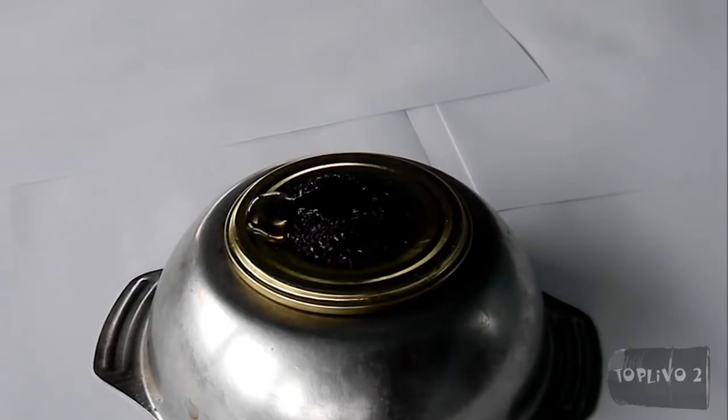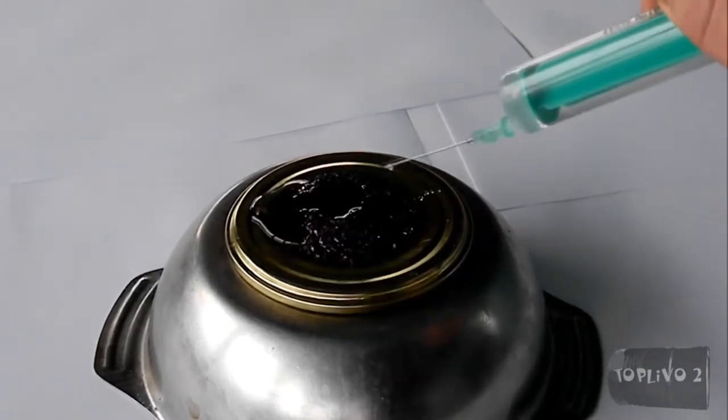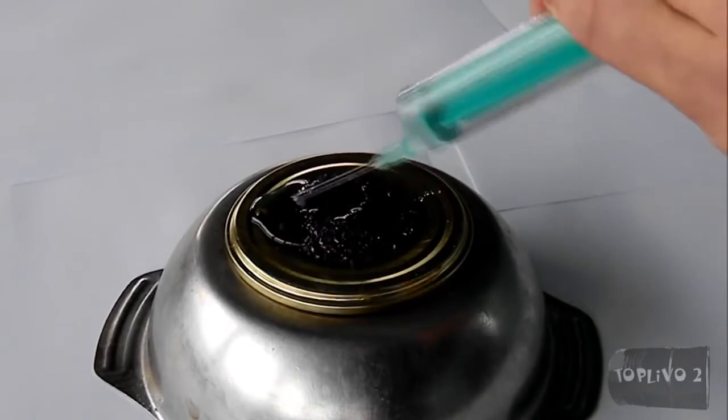Since my potassium permanganate is not ground, the reaction requires a lot of time. To accelerate the reaction, add a few drops of water.